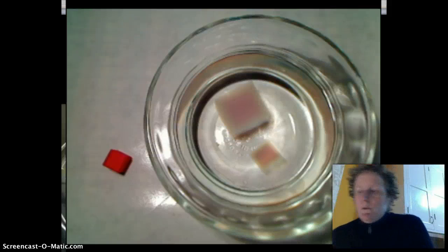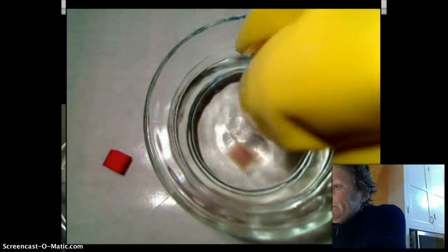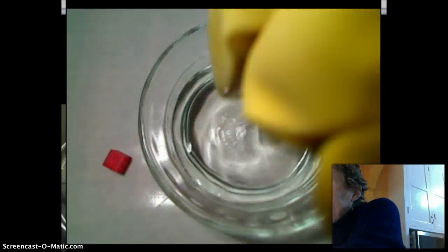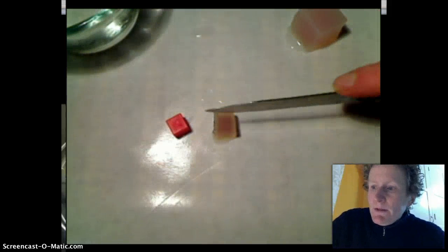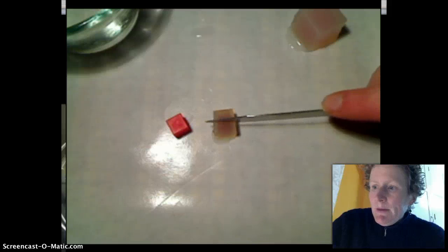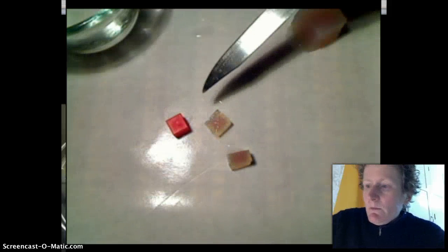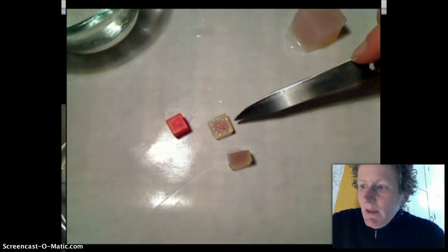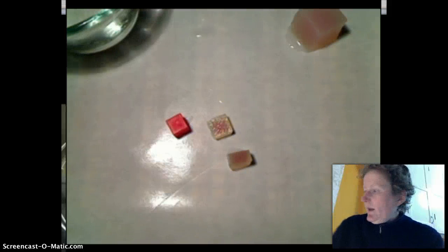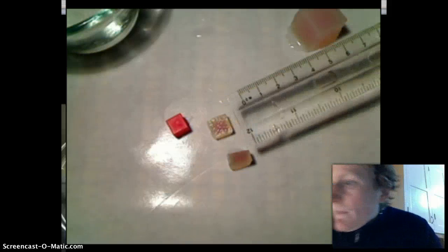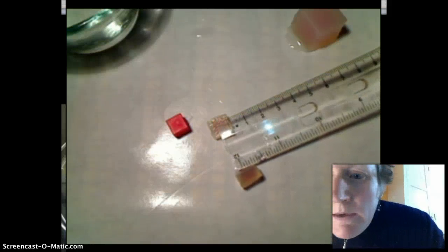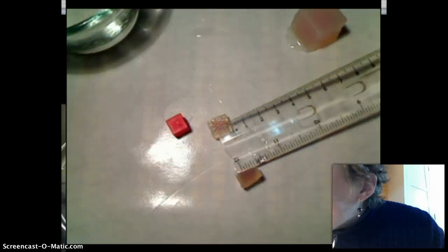Okay, we're going to take our agar cubes out of the vinegar and cut them in half to check out how far that vinegar diffused. Remember our agar cube here is the same as the one centimeter cube B. So we're going to cut that cell open and you can see the middle part is pink and the outside edge is white. And I will measure here. That's about five millimeters.